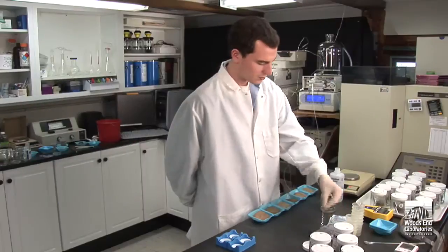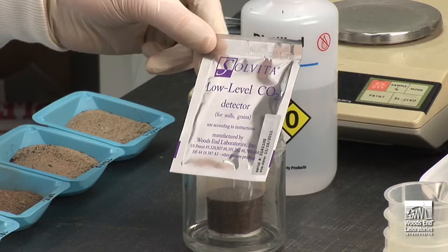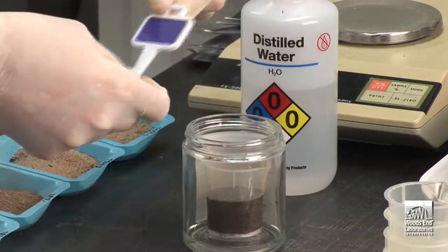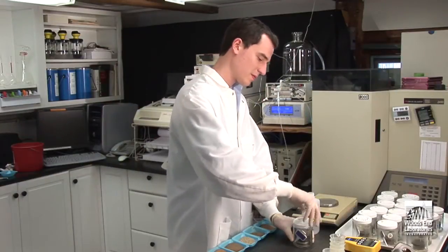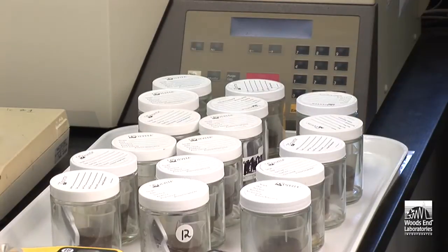Now select the low CO2 absorption probe contained in a foil package. Tear open and remove the soil CO2 paddle. Insert it alongside the beaker in the glass jar. Place the lid on securely and put the jars in an area for 24 hours at room temperature of 25°C.